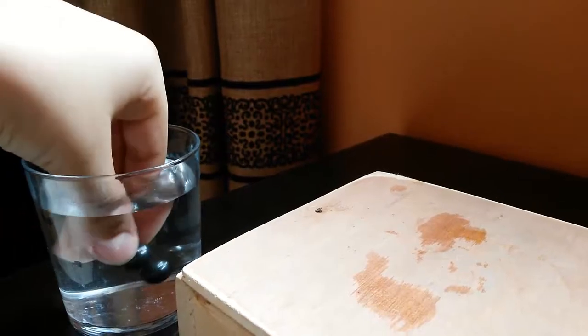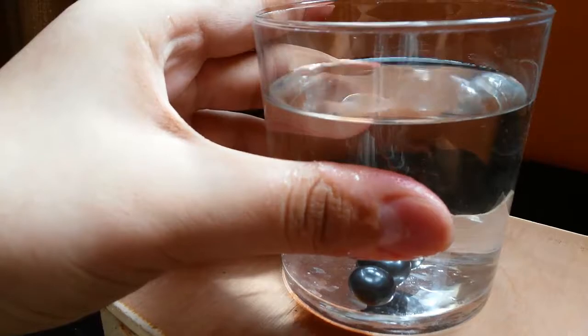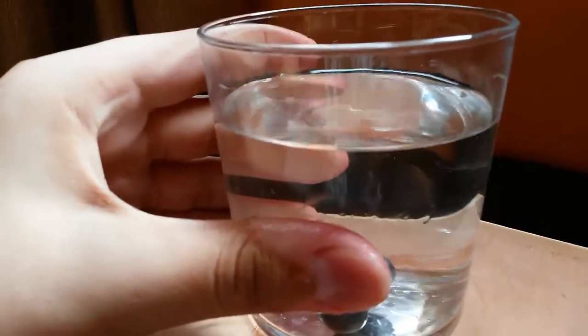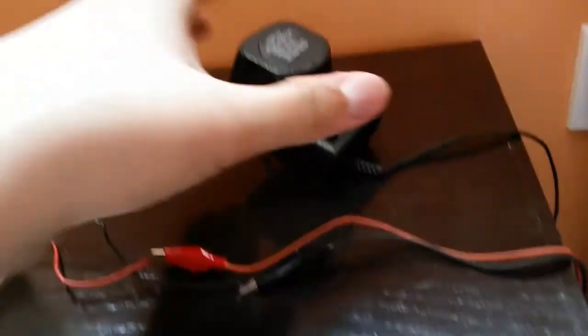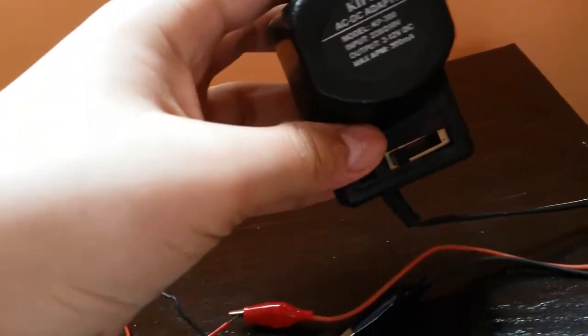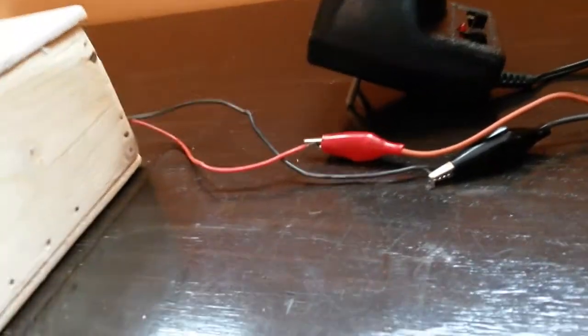For demonstration, I'll be using a glass of water. I'm going to put the magnets in and center them so they don't collide with the wall of the glass. To power the machine I'm going to use a small variable output AC-to-DC adapter, connected with some alligator clips.